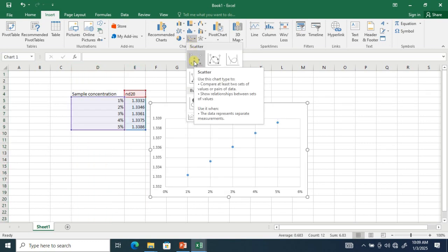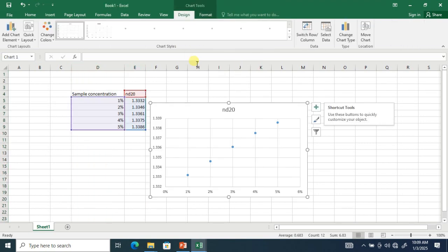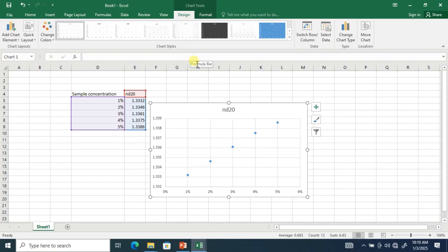You can see the standard curve like this. Ideally, a standard curve should always be a straight line. There are some experiments which you will encounter in your stage one where there will be some outliers, deviating from the straight line. It should not be like that, but you cannot do anything because it's a part of the experiment. So we have first given the standard curve.